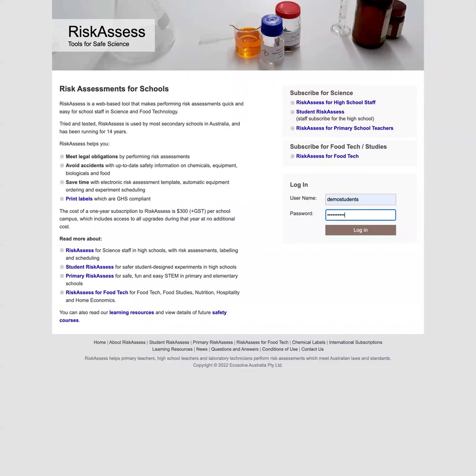Hi, I'll show you how to get started with Student Risk Assess. This video is for students. We have a different video for staff members.